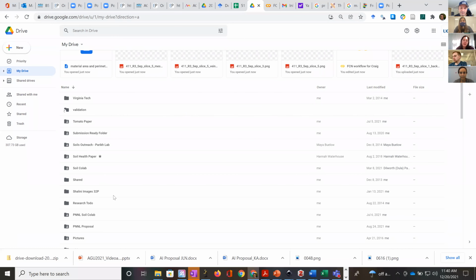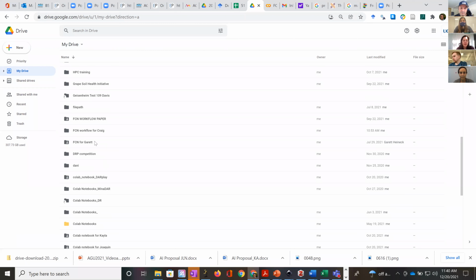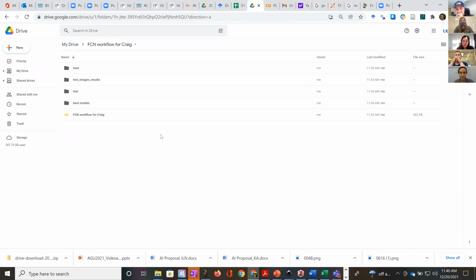So Devin, I was wondering, and maybe Mina, you can speak to this since you've been working with this process. So then are you to measure traits? Are you using Guillaume's code? Are you going to Fiji and doing things manually, or what traits and what does that look like after this?